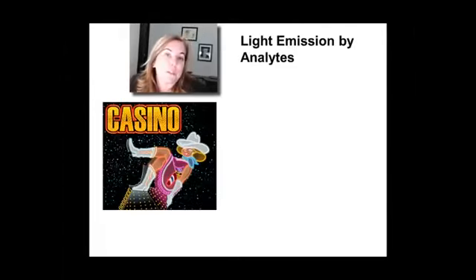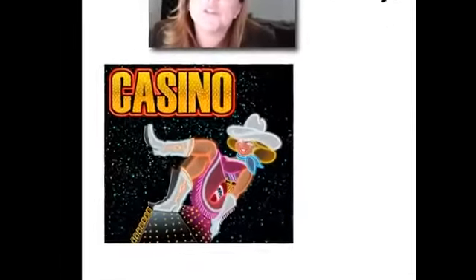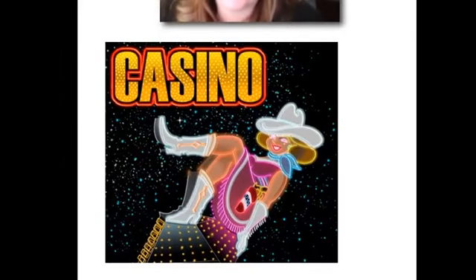Now I want to talk about something different. I want to talk about emission, which is very much a related process, but distinctive. So here you see a neon light sign, and I grew up in Las Vegas, Nevada, so I'm very familiar with neon lights. And neon lights are an example where light is not getting absorbed, right? It's getting emitted. It's getting created by the sample. And that's going to be a different kind of process.